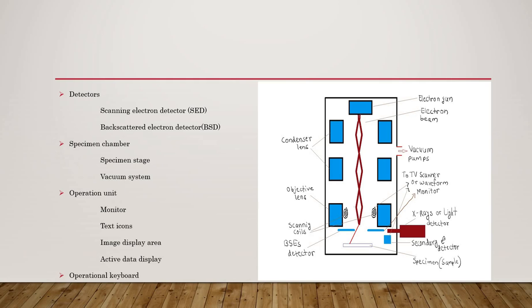A higher kilovolt is applied inside the cage, that is to the scintillator, to accelerate the electrons into the scintillator screen.